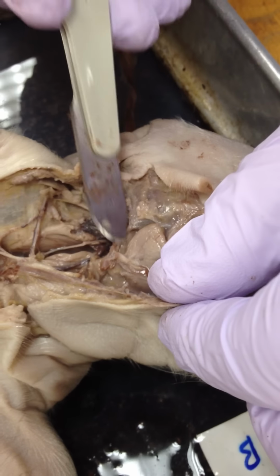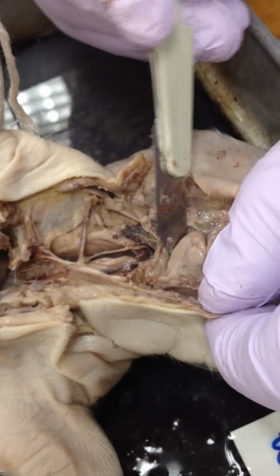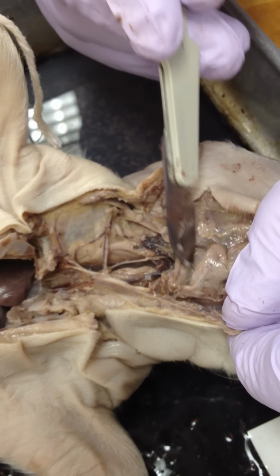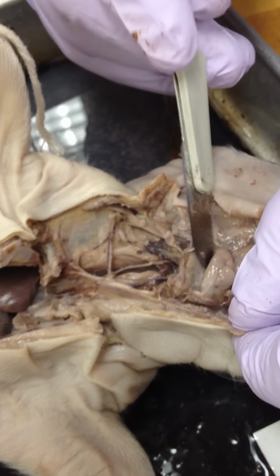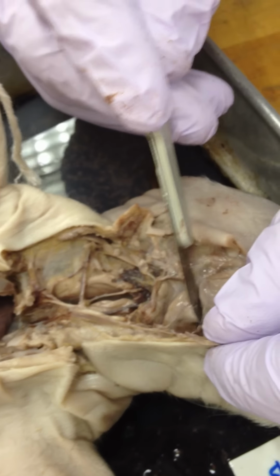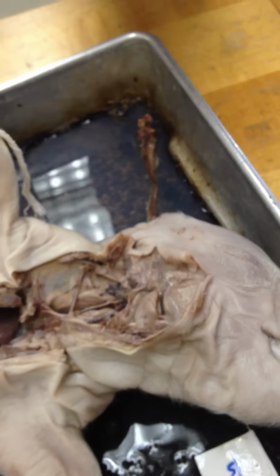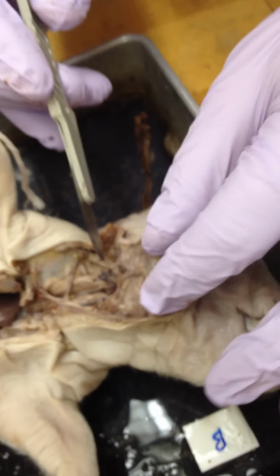So you get amylase and some of the lipases coming off of there. It's mostly water and some enzymes and ions. So that would be really cool to show, and it's easily testable, right?